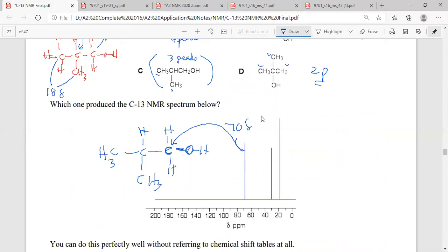Okay. Now next one, which is the one here. Now remember, the height doesn't tell you the number. Okay, it doesn't. This is the reading here, the chemical shift. The chemical shift will tell you what type of carbon it is. Of course, now this one here, right? The closest. This is carbon to oxygen. Okay, right? This one is carbon to carbon to carbon. This is further away, isn't it? So of course, this one will give you this one here, which is 30. So this one would give you 30. The further away, which is about 18 or 19, okay, right?